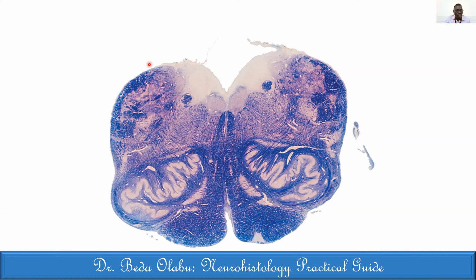Okay, good addition. That's an important addition. Thank you. So we can consolidate what you have said with what Dr. Kibaso said, and we can then agree. So I agree with Dr. Kibaso on the fact that these are pyramids and this is the inferior olivary nucleus and this is the lemniscus, the medial lemniscus system and this is the medial longitudinal fasciculus.